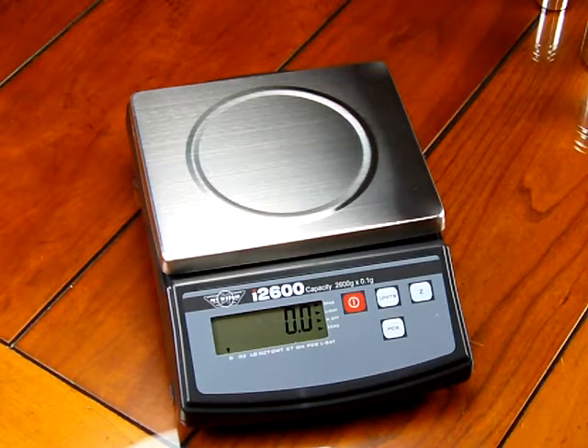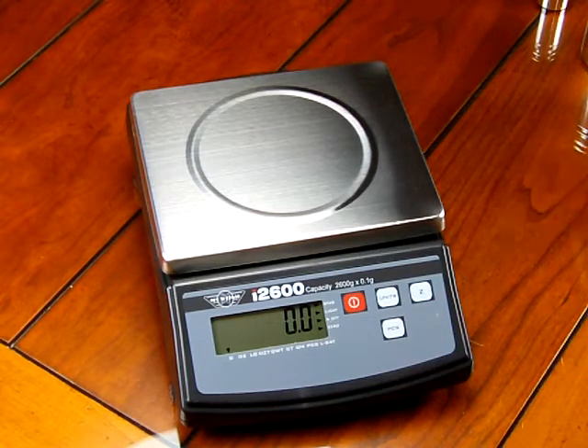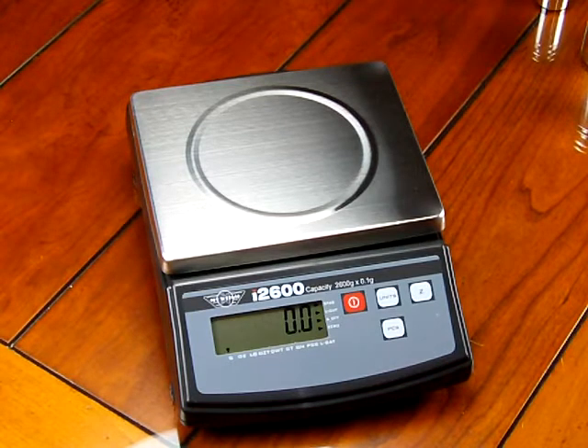Welcome. This is Precision Weighing Balances' video on the i2600 digital scale. This scale offers 2600 grams weighing capacity and increments in a tenth of a gram readability. This scale is classified as a portable top loader, and might be used in a science classroom. We're just going to go through some of the features that the scale has to offer.